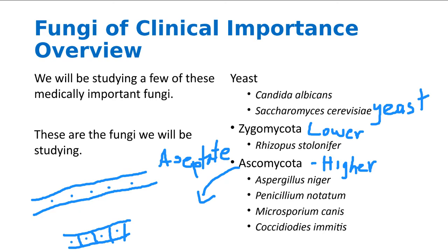Those are called septate mycelia because they have separations. Okay? Any questions so far? So the aseptate are those with the lower, the zygomycetes. That's correct. Okay? Let me show you what I mean.